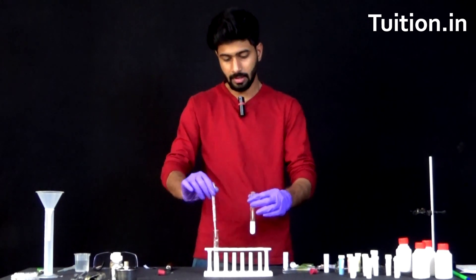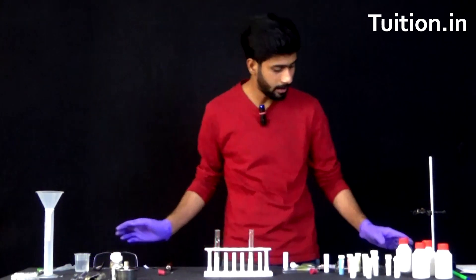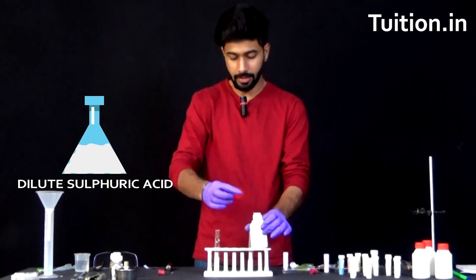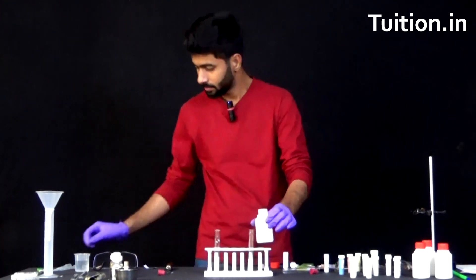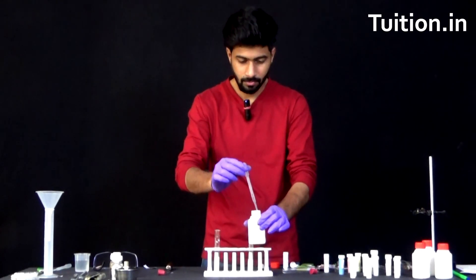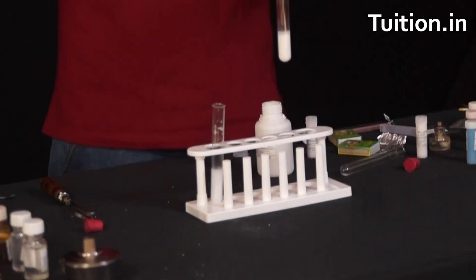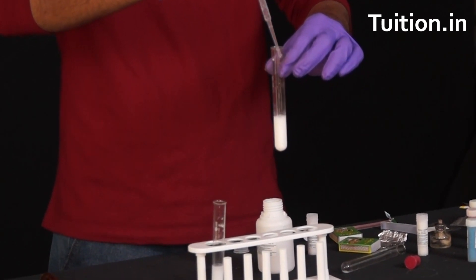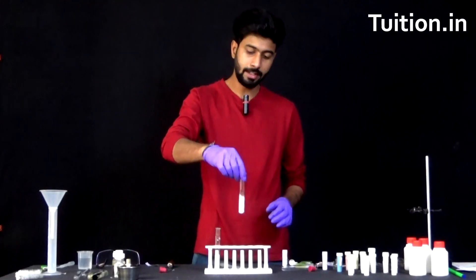I think it's all out now. It's time for us to add a few drops of dilute sulphuric acid into this solution. So here is our dilute sulphuric acid. Let's carefully remove it and put a few drops in. Let's shake this.